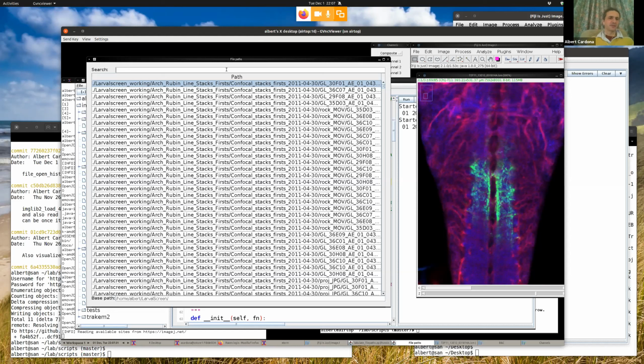And then because it's tens of thousands of files, what I'm not going to do is try to browse them one by one. And in the first place, if I can backtrack a bit, what motivated developing this very small graphical interface is the file share is slow. It's mounted over Samba, over network file system.